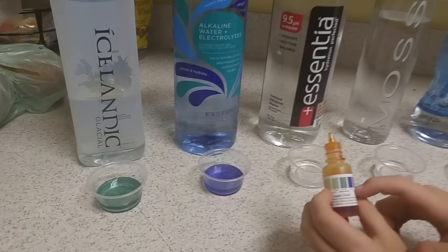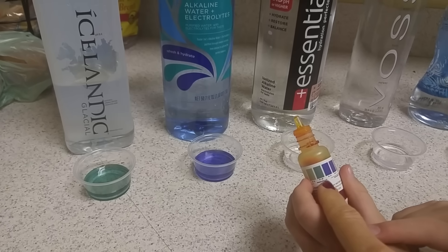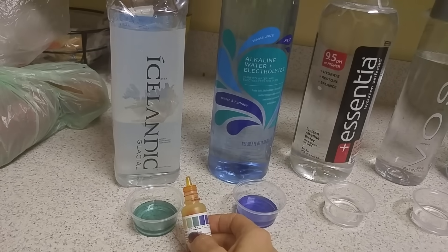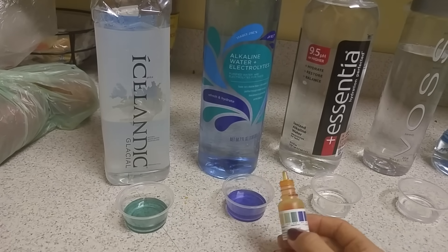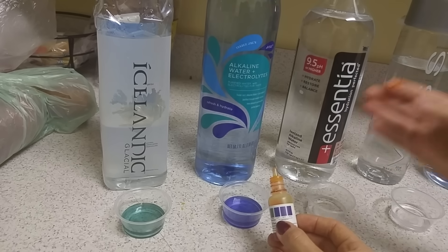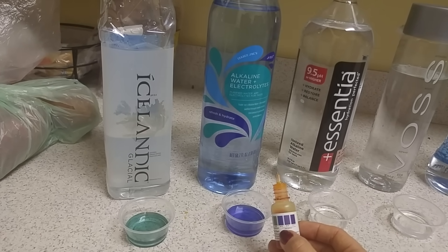Comparing the two: Icelandic is measuring about neutral — around a 7 — even though it claims to be over an 8. Trader Joe's electrolyte plus water is coming in at about an 8, maybe 8.5. So that's really good for Trader Joe's, though they advertise 9.5.